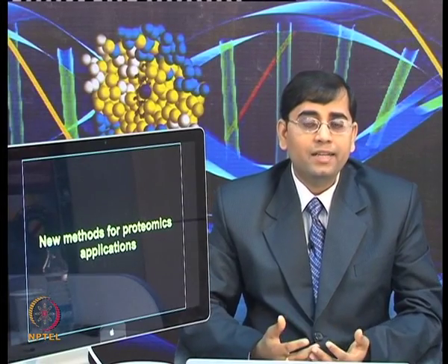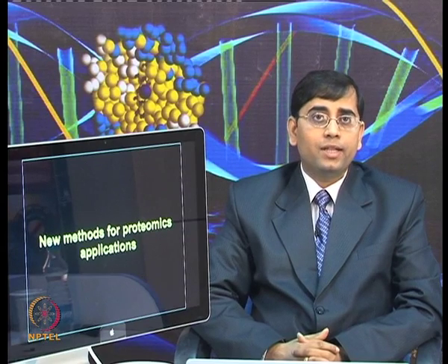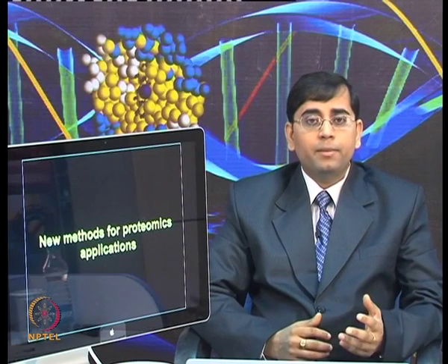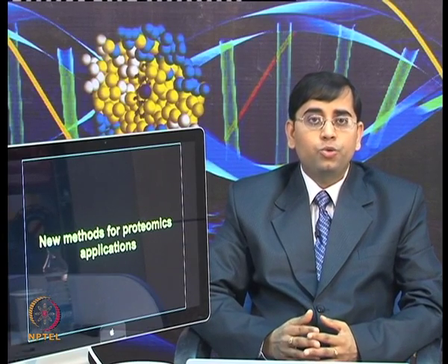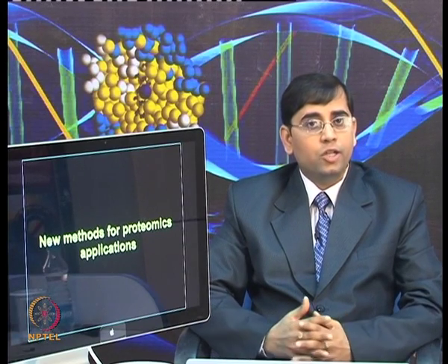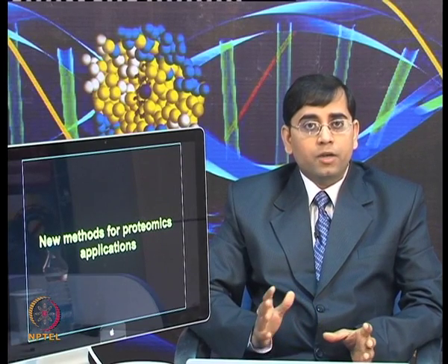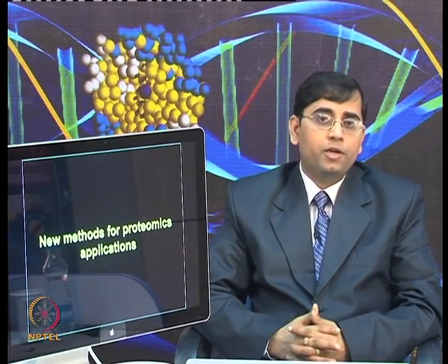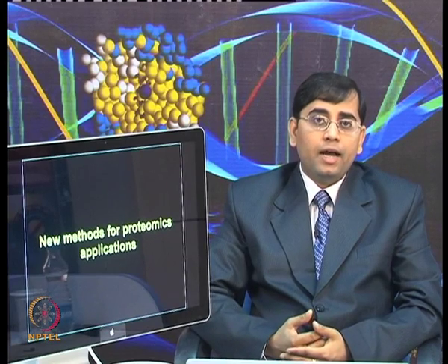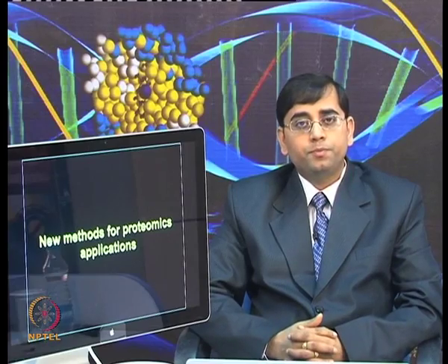So, now I have described the workflow of performing two-dimensional gel electrophoresis, and in this workflow today we have talked about staining methods as well as how to scan and analyze those images using various software. After that, you have completed the workflow of two-dimensional electrophoresis, but I will still try to teach you other gel based methods which can be employed to study the proteome.